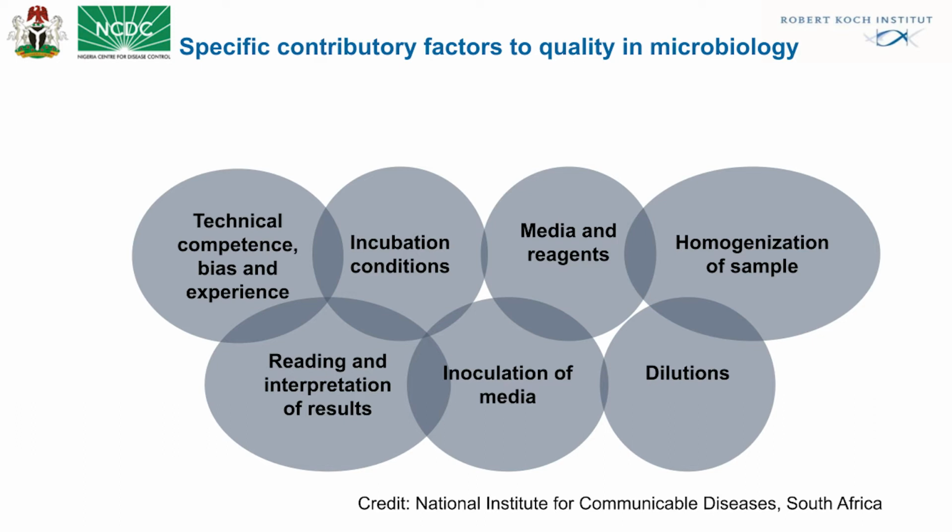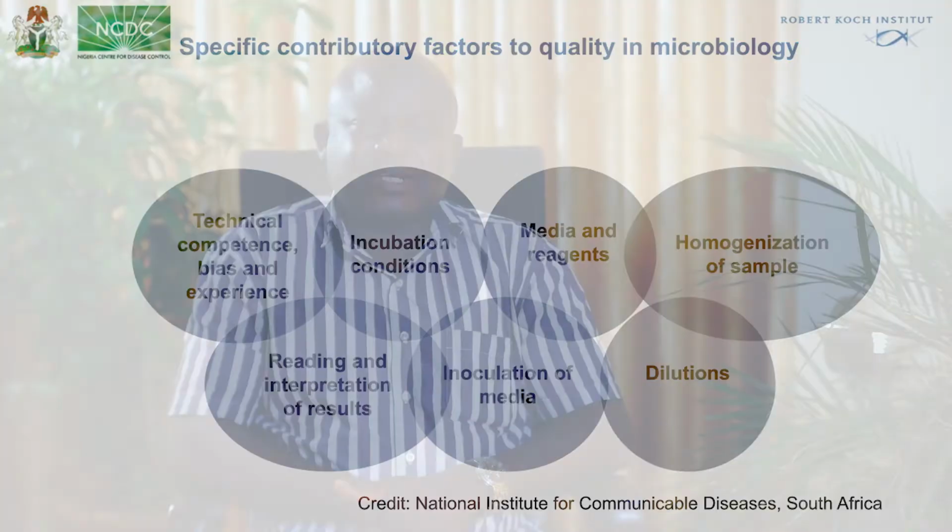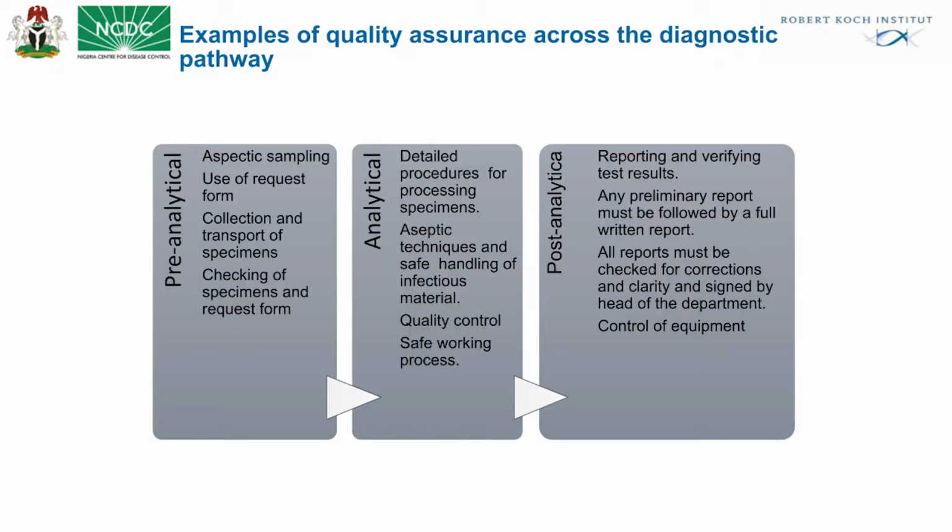Incubation conditions have to be maintained. Media and reagents need to be prepared correctly. Homogenization of sample, reading and interpretation of results. Inoculation should be onto an appropriate medium so as to get our result, and our dilutions too should be accurate. Examples of quality assurance across the diagnostic pathway.